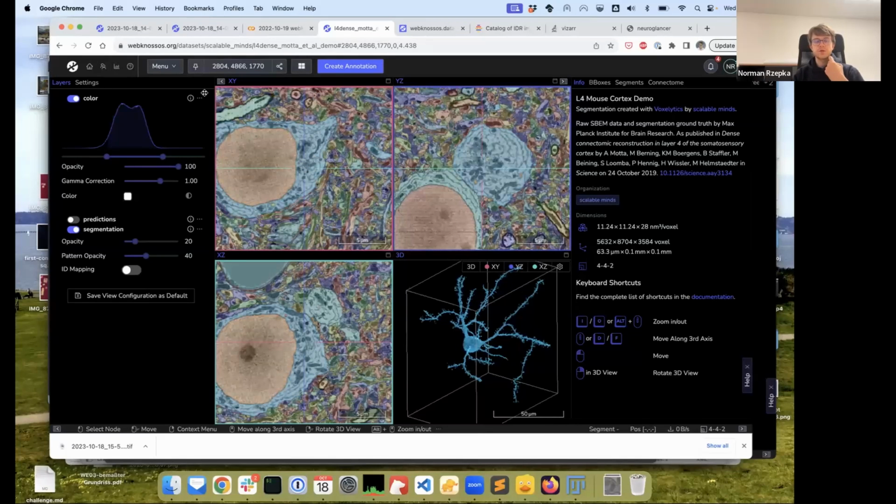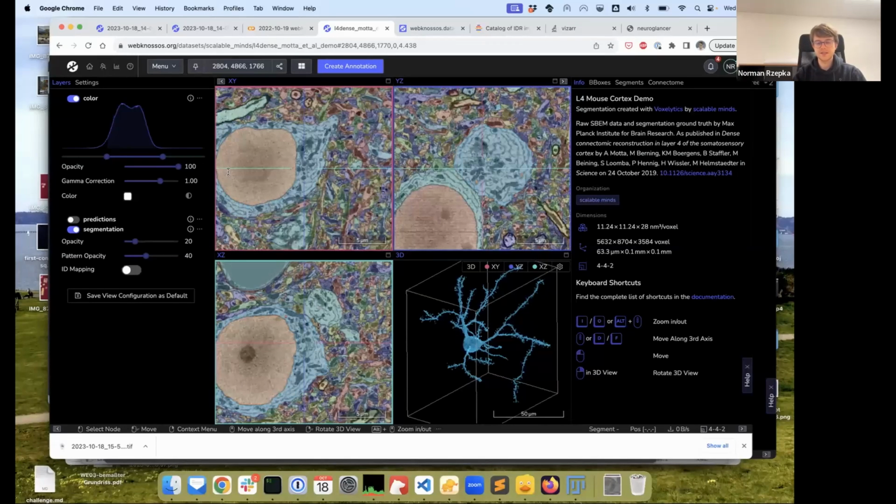Yeah, so that's a feature that if you're interested in, you should keep an eye out over the next, let's say, year or so, because we're rolling this out and we're figuring out the infrastructure and figuring out what kind of models that we want to include with this. So mitochondria models are next on our list for EM data, and then we're also thinking about integrating models from the bioimage model zoo. So that basically it becomes very easy to use these automated segmentation models from Webknossos.